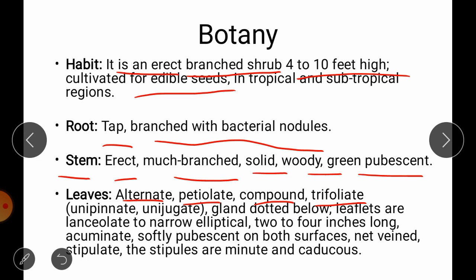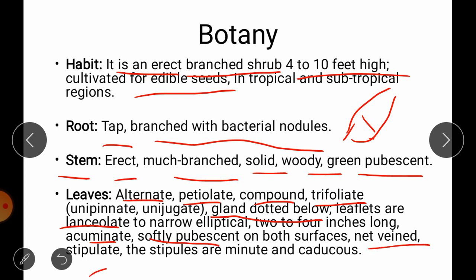The leaves are alternate, petiolate, compound, trifoliate, and gland-dotted below. Leaflets are lanceolate — meaning they are narrow at both sides and widest at the center — to narrow elliptical, 2 to 4 inches long, acuminate, softly pubescent on both surfaces, and net-veined with stipules.